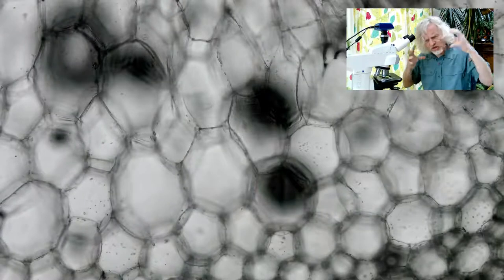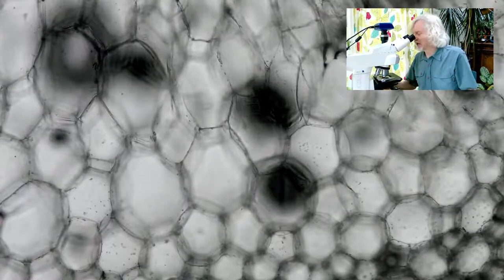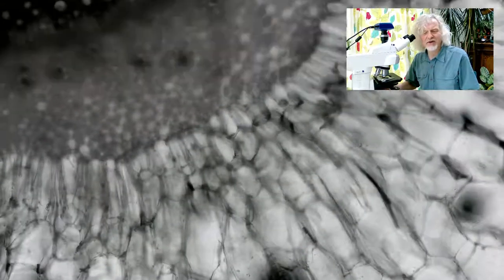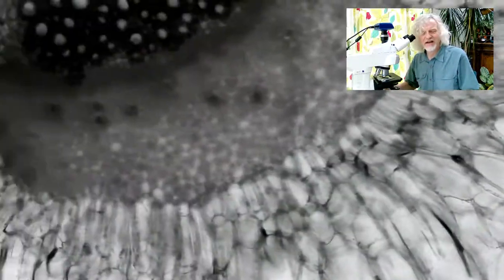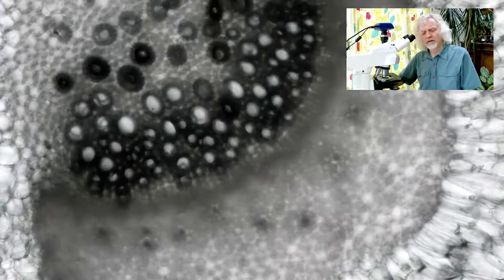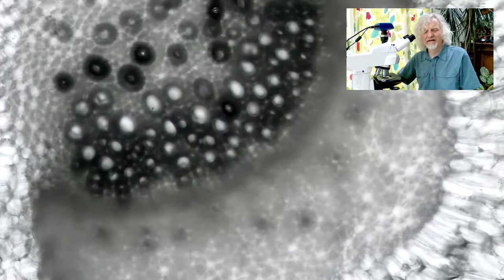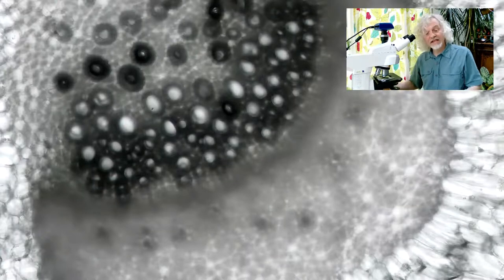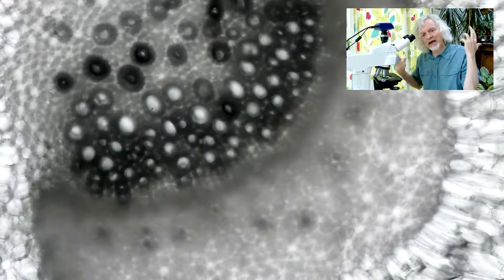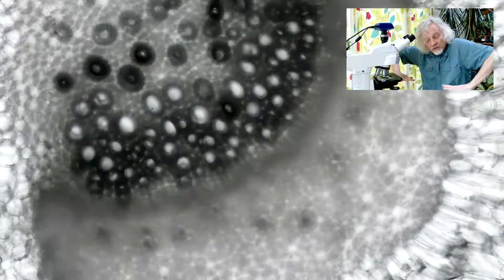And they're just lots and lots of cells all packed together. There's not a huge amount interesting in those cells. But if we kind of head inland from here, we should get to a section which is a bit more interesting. Because what we have here is this bit here, and this bit here. This is the stringy bit in the celery. And this is one of those vascular bundles. And the vascular bundles are made up of two separate sections. It's made up of the tissues that carry liquid from the roots up to the leaves. And that's called xylem. And that's what these things are. And they form these tubes that run up. They're called tracheids, that run all the way up.